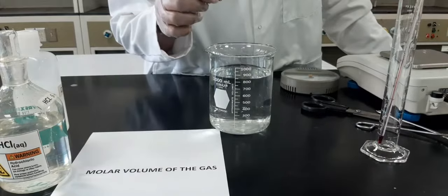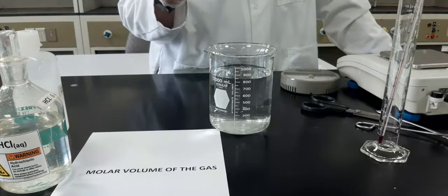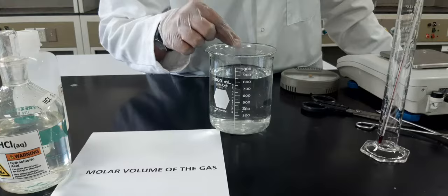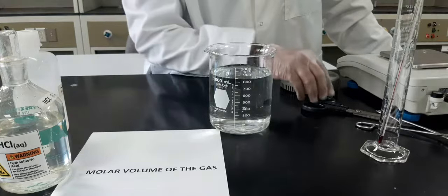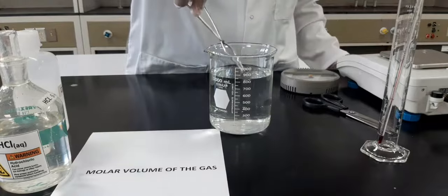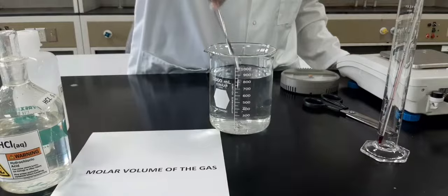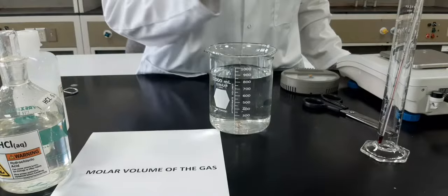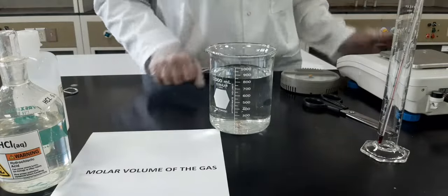Now you'll take the piece of magnesium and drop it into the water, and keep it in the center so that you can place the measuring cylinder over it.